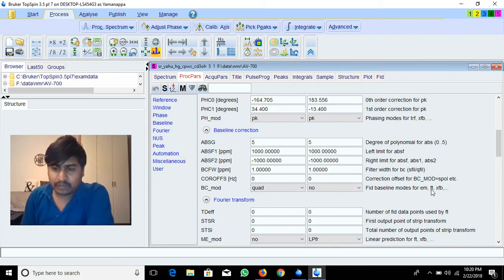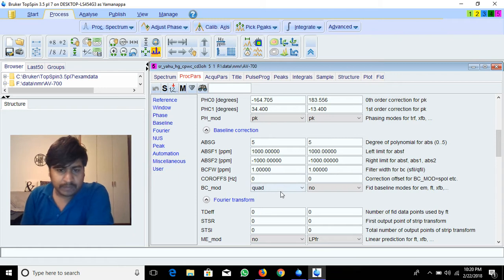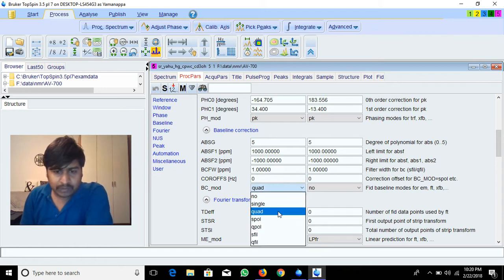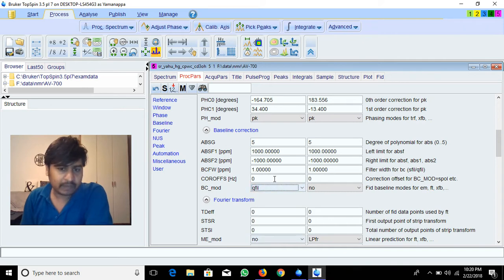The BC mode and BCFW — these two you have to set up. BC mode is currently set as quad; change it to qfill. The BC mode width is 1 ppm by default.